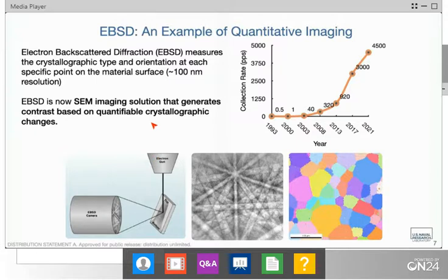And this increase in speed is something that's really also enabled this, right? When I first started doing this, I was somewhere in this domain of looking at how quickly we can collect points. And we're kind of still in that area of how many seconds per point versus points per second. And now with the advent of faster and faster cameras, the CMOS cameras that have recently come into fashion, right, we are indexing over 1,000 points per second. So that is highly advantageous.